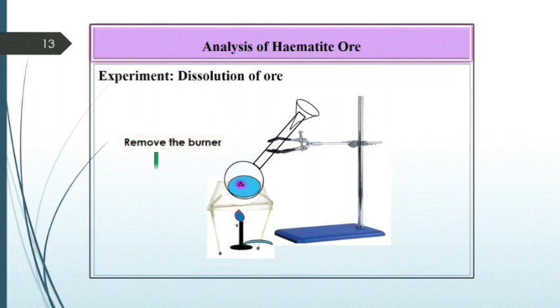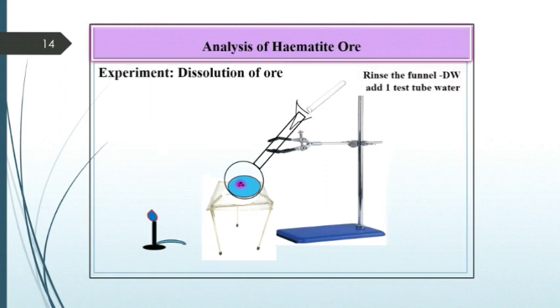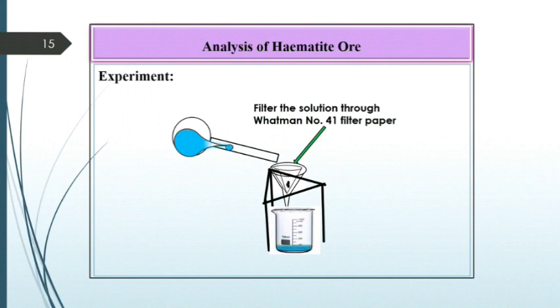Now again remove the burner and cool the solution well. After cooling the solution, rinse the funnel by using distilled water. Add about one test tube of distilled water. Now filter the solution through Whatman number 41 paper.